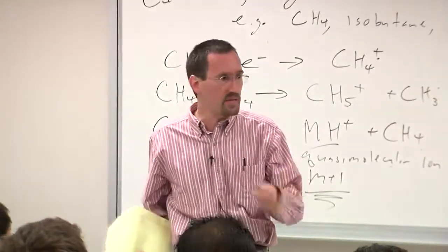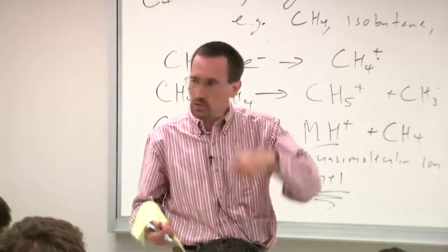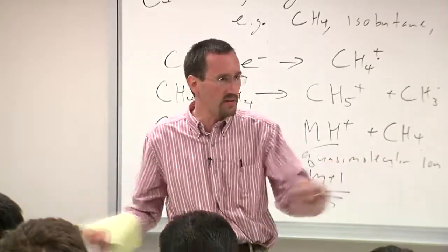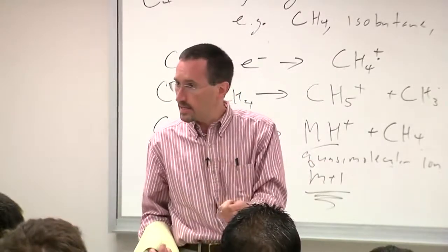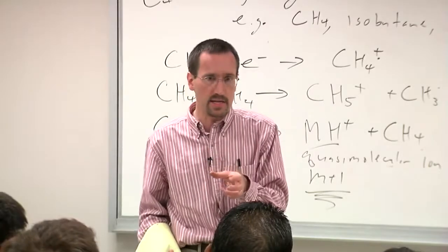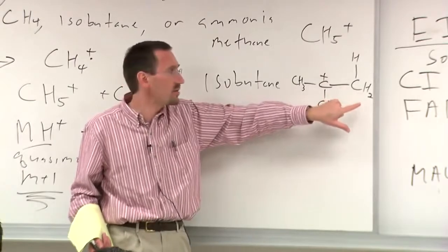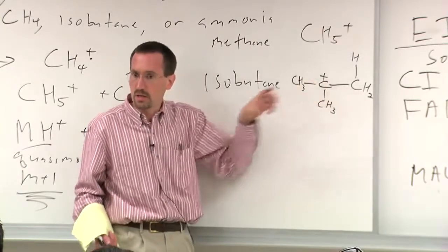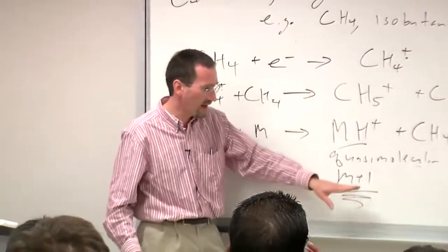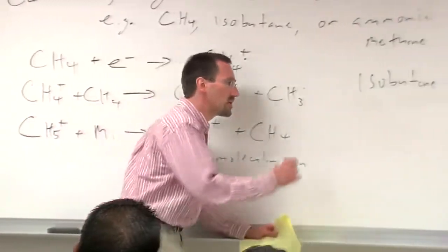That's important because that means when that proton, remember this is in the gas phase, so when a reaction occurs and the reaction is exothermic, the molecule is hot. It's vibrating very strongly, and it is still prone to fragmentation. So the less energetic the ionization, the less enthalpic the ionization process, the less strong the acid, the less prone the molecule is to fragmentation, and the more likely you are to actually see a quasi-molecular ion and not some fragments.